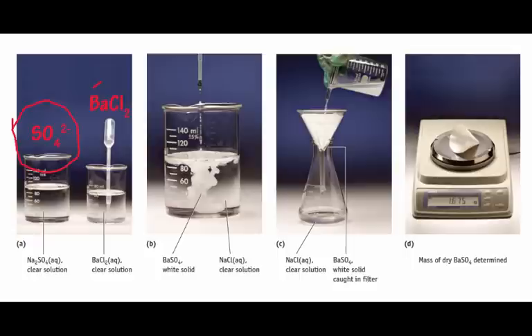To analyze it, we'll take a solution of barium chloride. It's in our beaker here, a nice soluble barium chloride, and we'll add it slowly to the sulfate solution using a dropper.